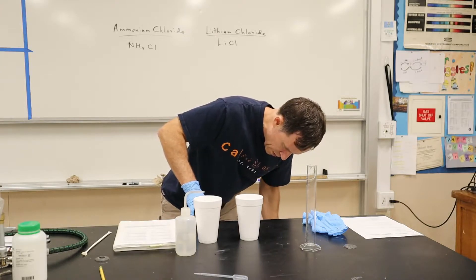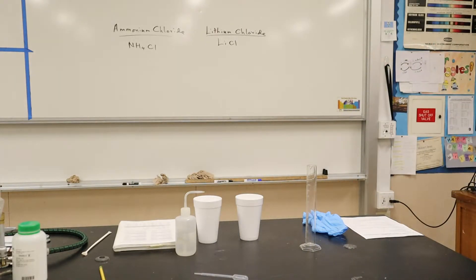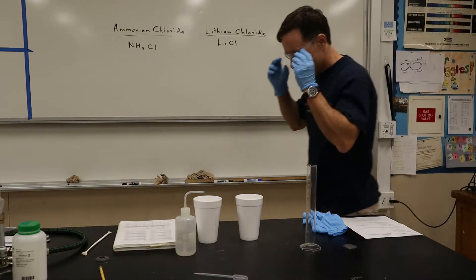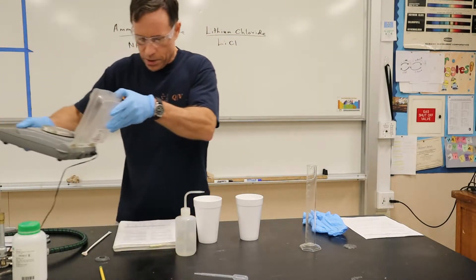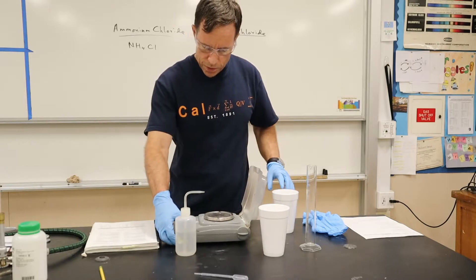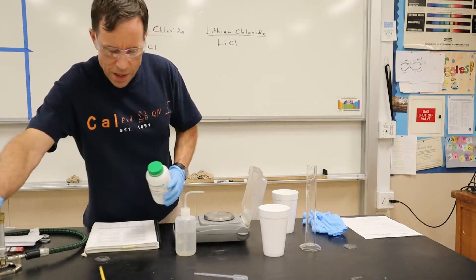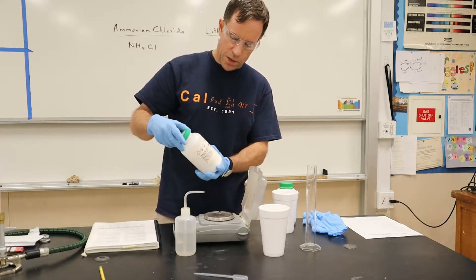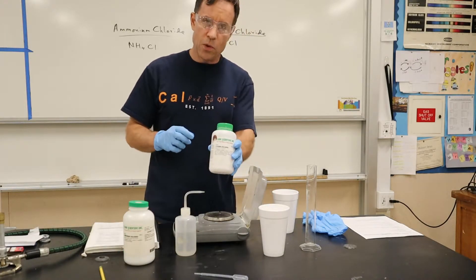I should be wearing goggles, so I'm going to put some on as soon as I can find them. Now what I'm going to do is weigh out on the scale. I'm going to turn it on and zero it. I've got two substances: ammonium chloride and lithium chloride.